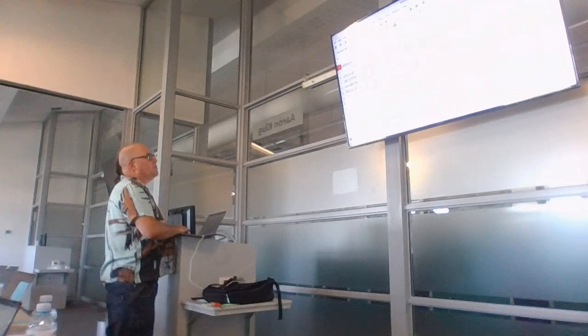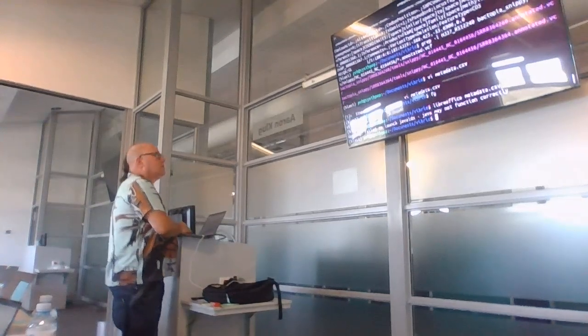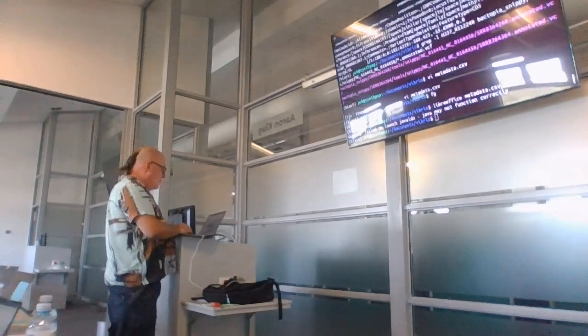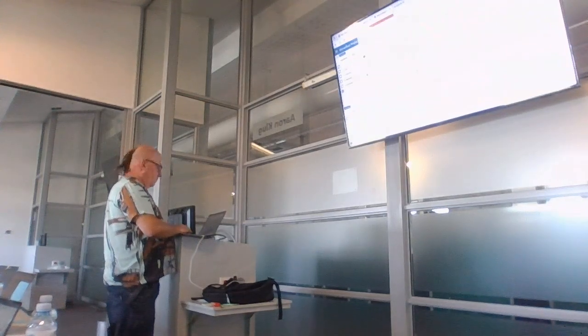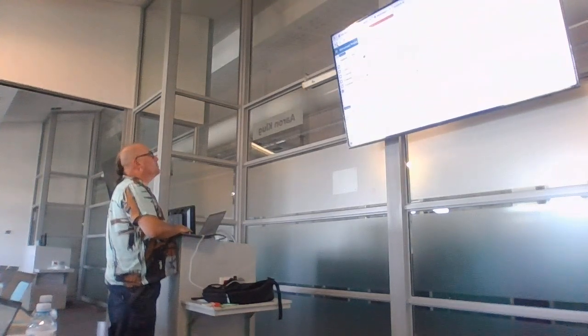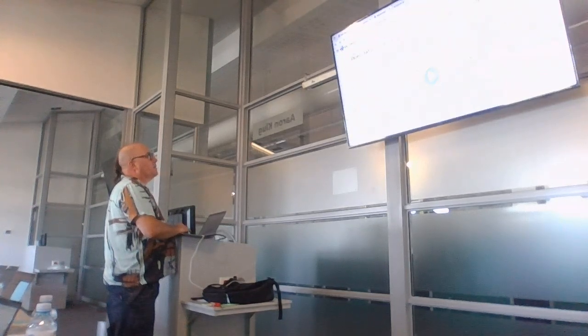So I was trying to very manually add this column. Okay, it looks like I didn't do too bad a job because there it is. I should automate this, never manually do stuff like this, because manually doing stuff is how you make mistakes. I'm going to abandon this project and start again.